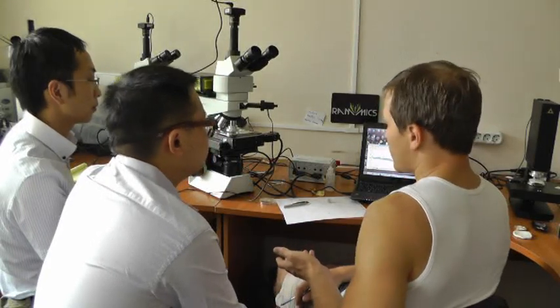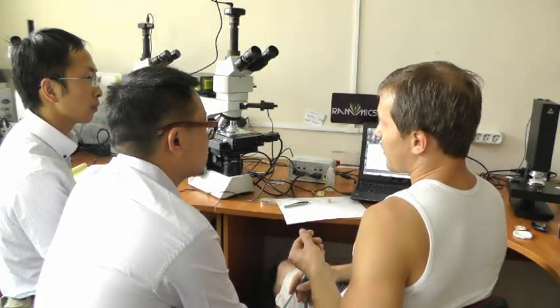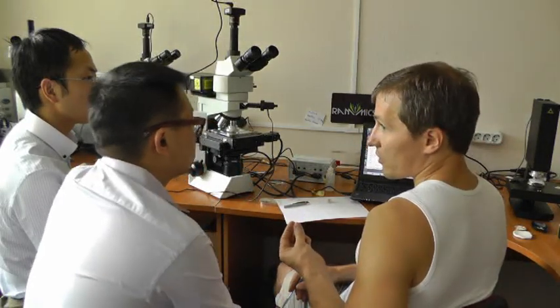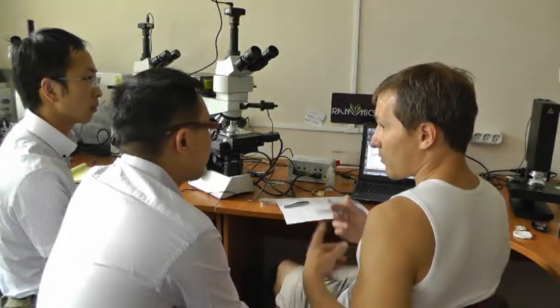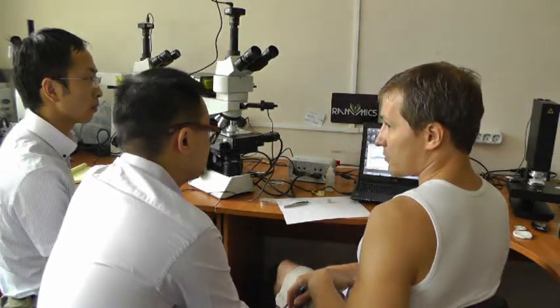It's very low because we have high resolution, and average particle size is 5 to 10 microns, but the laser spot is 2 microns in size, and it is almost impossible to see the combined, overimposed spectrum.